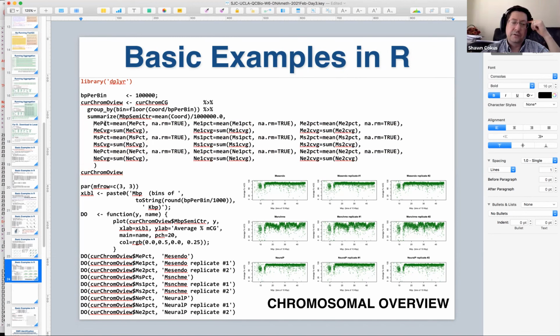So for the replicate collapsed mesendoderm percent methylation, I want you to get that from the mini table by taking the mean, the average, of what is also called the ME% column in the mini table. And I want you to ignore the NAs when you do that mean. Right? So that is basically the mean in whatever the current bin is that corresponds to the current mini table. And we summarize that column, rename the column the same thing, but now instead of a whole ensemble of values, it's just got the single mean value, with the NAs ignored.